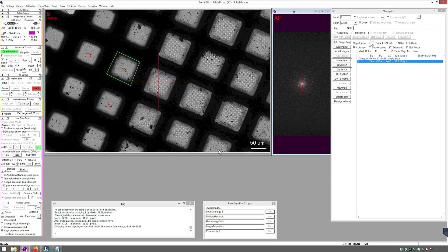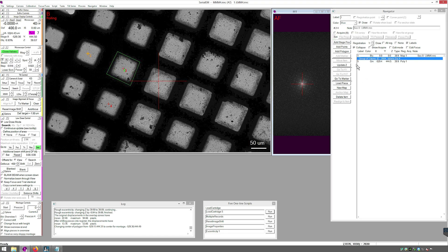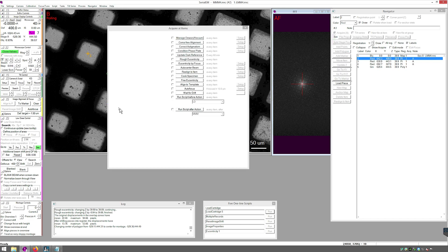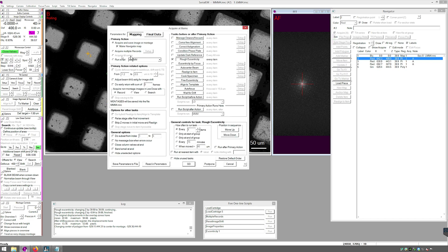The software is centering the stage in the center of your polygon. Next, add acquire tags to the points you have laid, or add additional points. Now that your points have acquire tags on them, use Navigator Menu, Acquire Add Items, Parameters for Mapping, and make sure that the primary action is Acquire and Save Image or Montage with Make Navigator Map checked and Rough Eucentric Every Item checked. Verify that your montages will be saved to the correct file and then press Go.